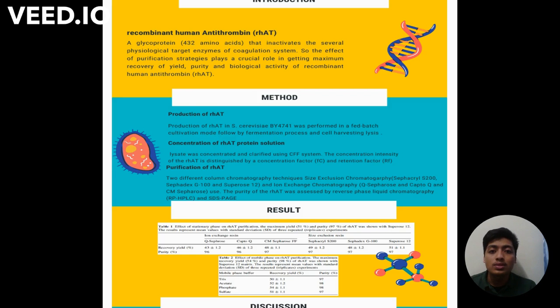The main objective of the purification process is not only the exclusion of undesired contaminants, but also the purification of the target protein. Ion exchange chromatography (IEC) is certainly the most commonly used technique for the separation and purification of proteins, polypeptides, including nucleic acids, polynucleotides, and other biomolecules. The reasons behind the success of IEC are its resolving power, broad applicability, high capacity, and the simplicity of the system.